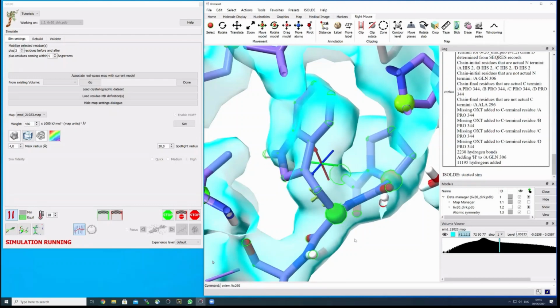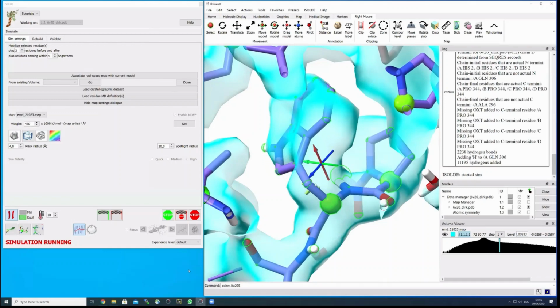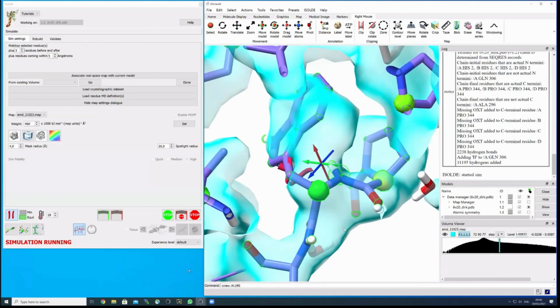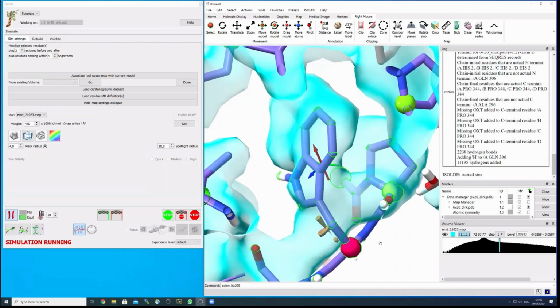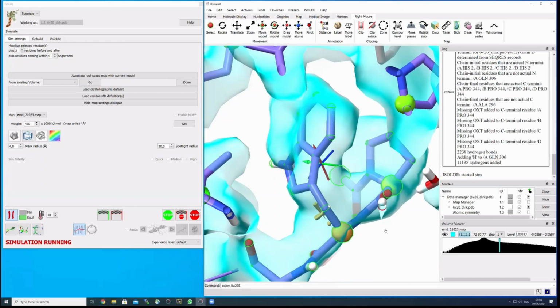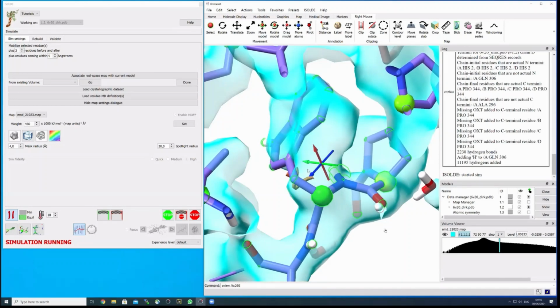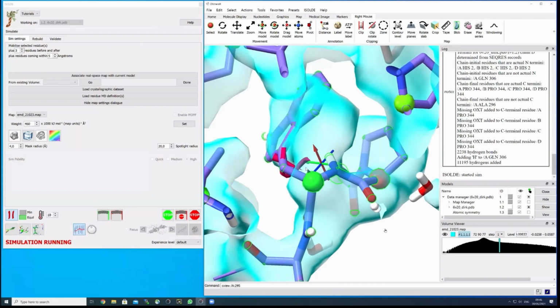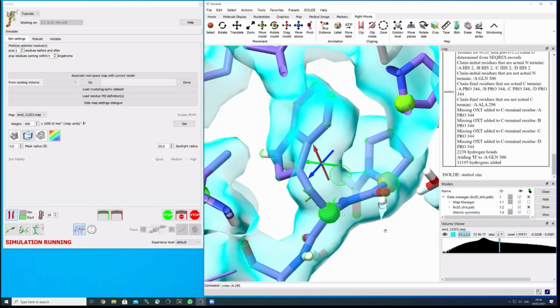So I can now left click, for example, on this main chain, and I can actually start moving it around wherever I want. And you can see that whatever I do, I will manipulate the model. Sometimes the backbone conformation will go into a red dot, then I can move it back, it will be good. If I go in the other direction, you see that now the backbone is okay, but the rotamer is actually not fine, things like that.